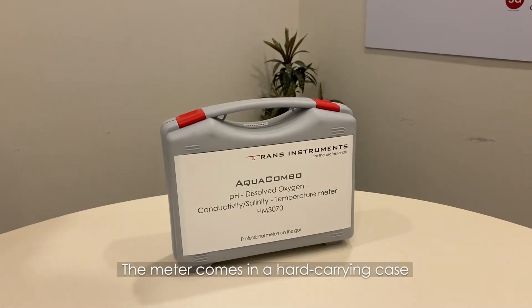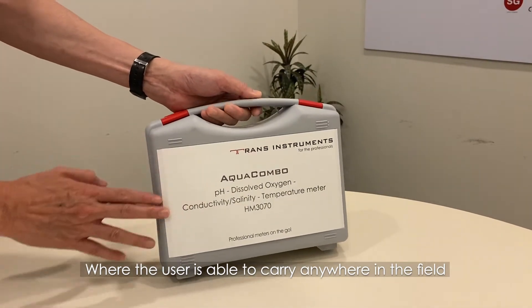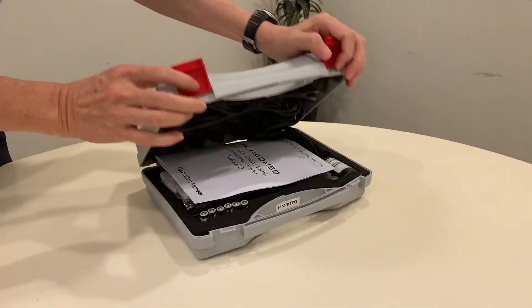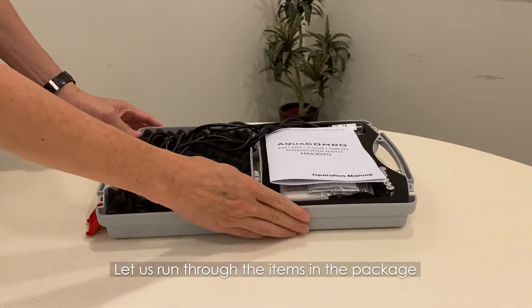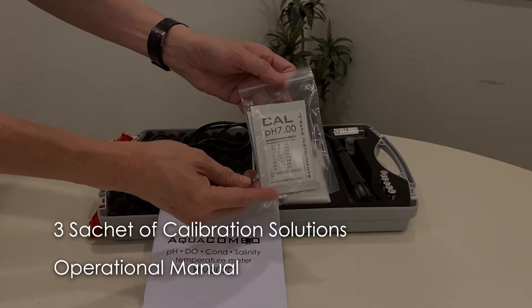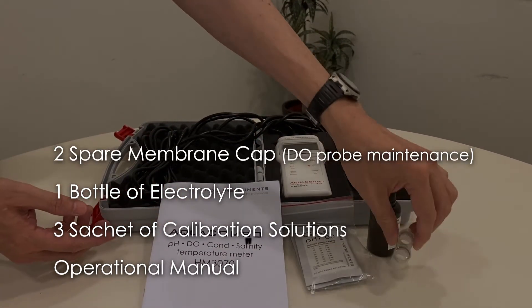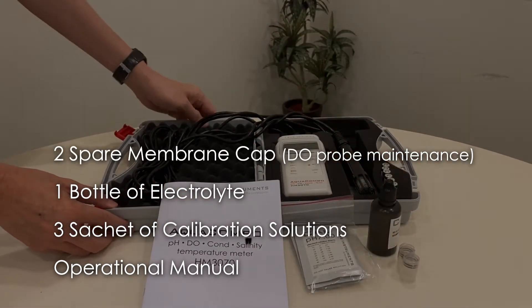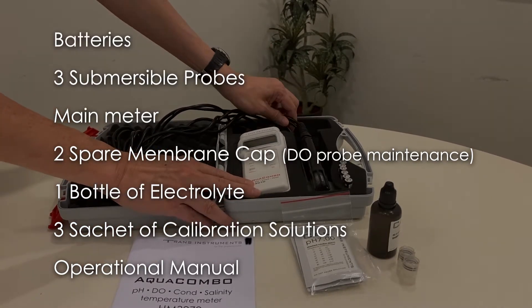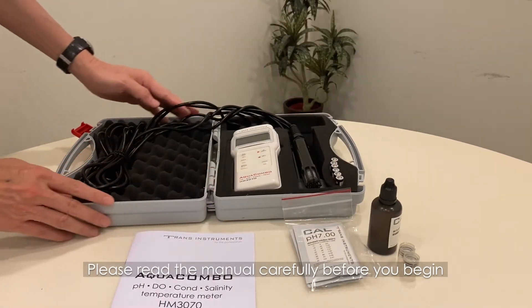The meter comes in a hard carrying case, allowing the user to carry it anywhere in the field. Unlock the case by lifting the red latch. Let us run through the items in the package: an operational manual, three sachets of calibration solutions, one bottle of electrolyte, two spare membrane caps for DO probe maintenance, the main meter, three submersible probes, and batteries to be installed in the meter. Please read the manual carefully before you begin.